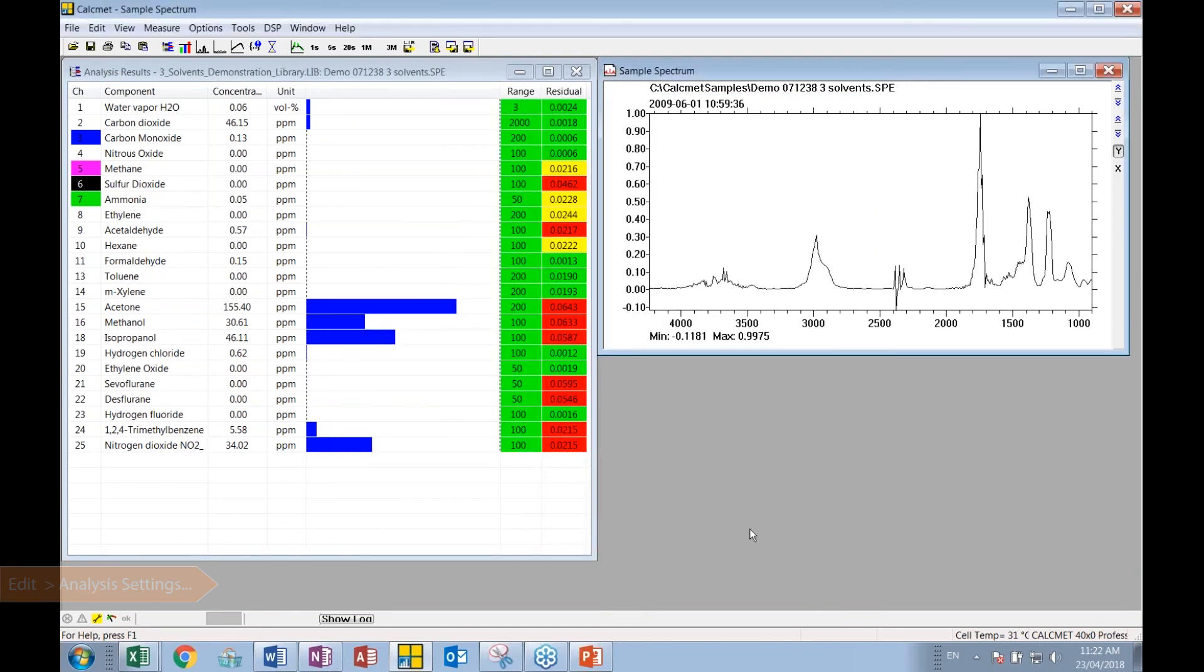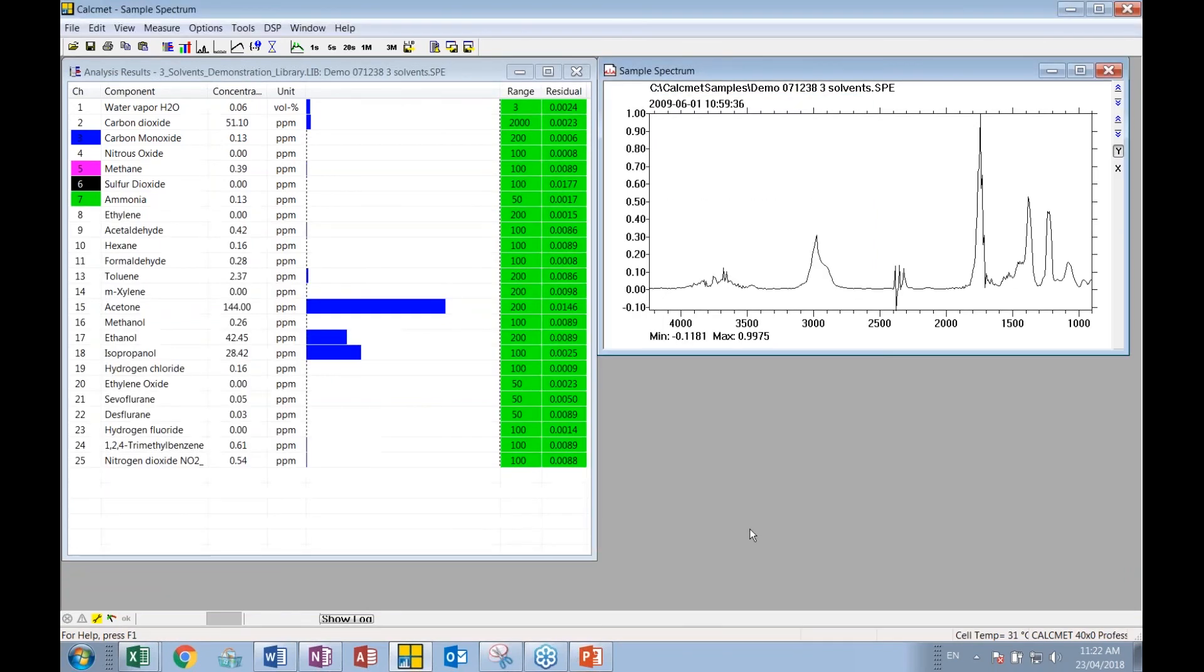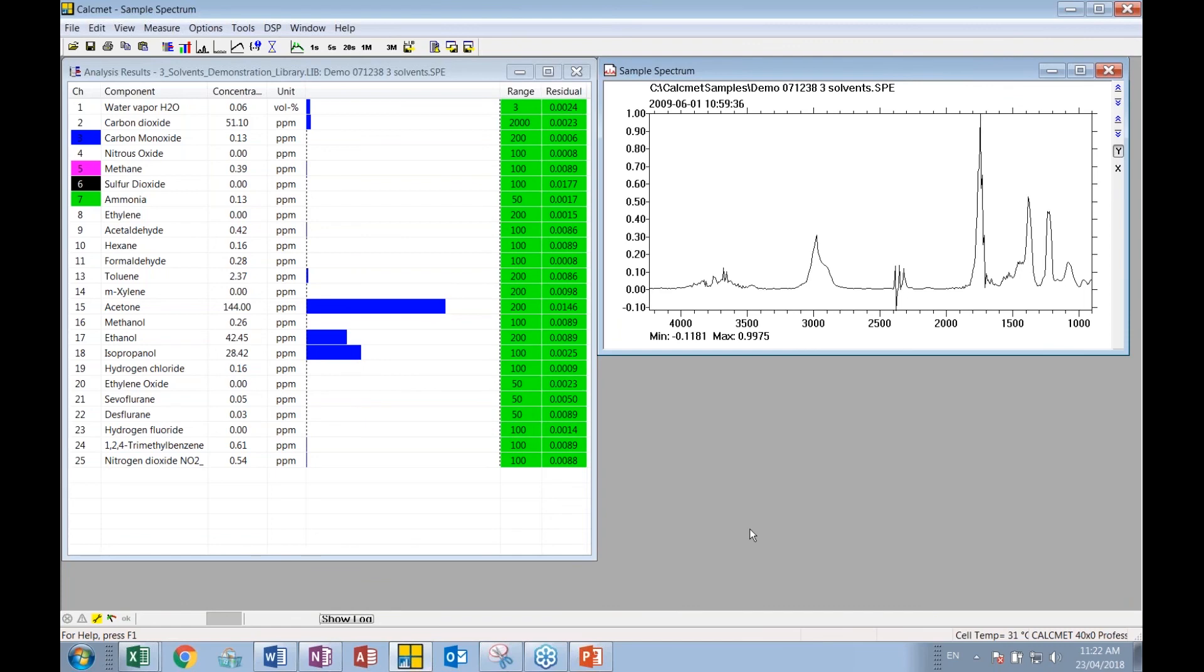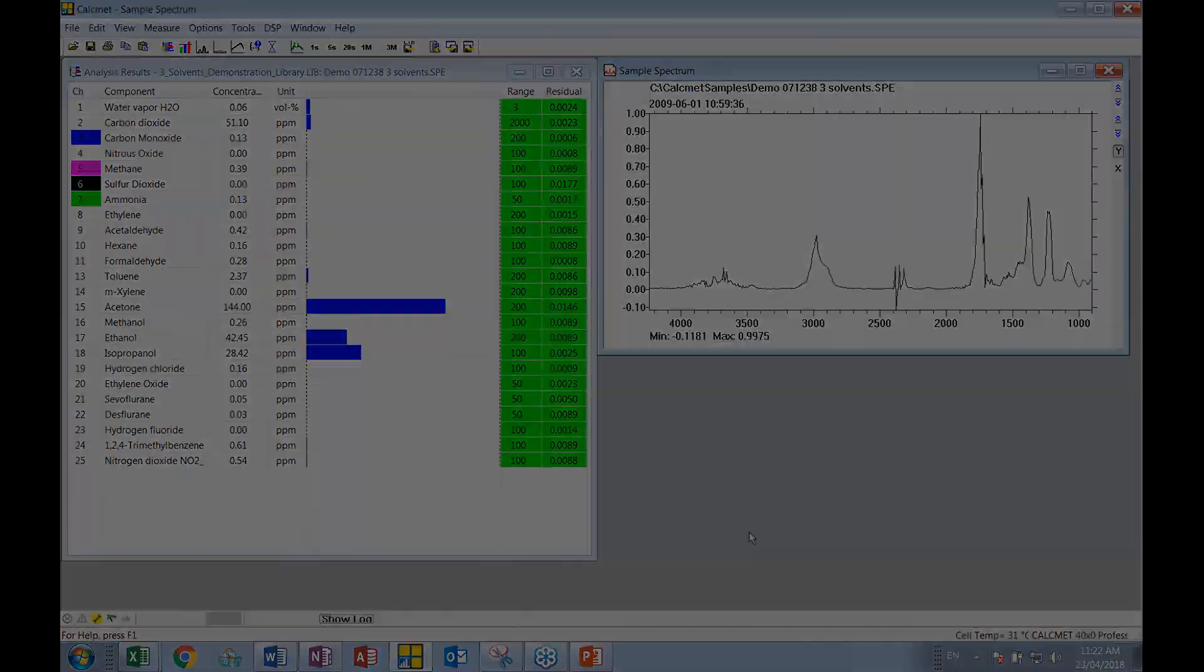And so we'll reanalyze. And now it's come up with a successful fit that the residual value is all green. Green is a successful analysis. So it's the three major components in this sample have been identified and quantified. So now the user can put the controls in place.